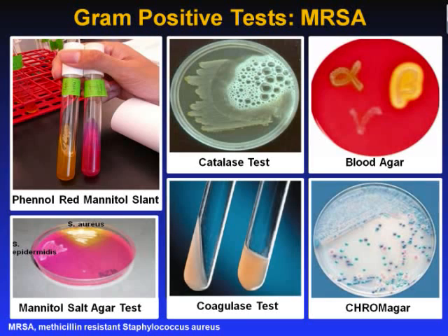Staphylococci and micrococci are catalase positive. If not, the organism is catalase negative. Streptococci and enterococci are catalase negative. While the catalase test alone cannot identify a particular organism, combined with other tests such as antibiotic resistance, it can aid in diagnosis. The presence of catalase in bacterial cells depends on both the growth condition and the medium used to grow the cells.